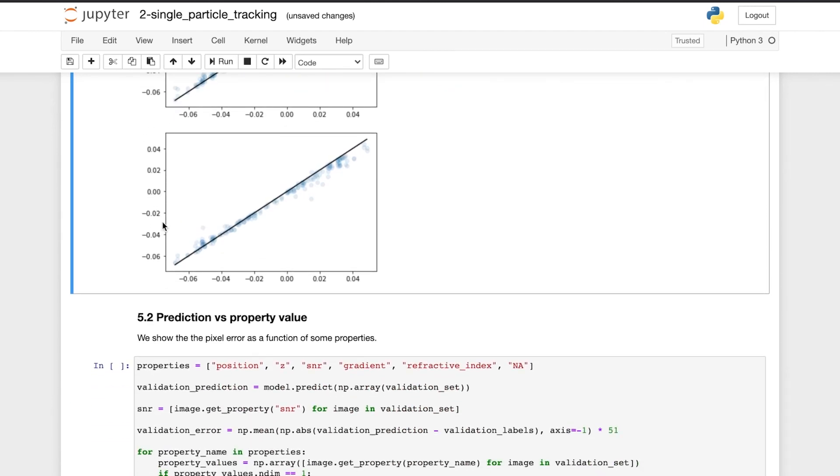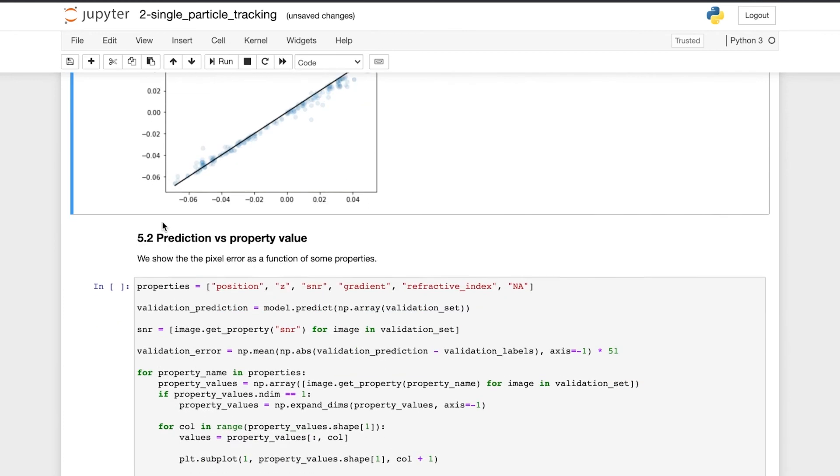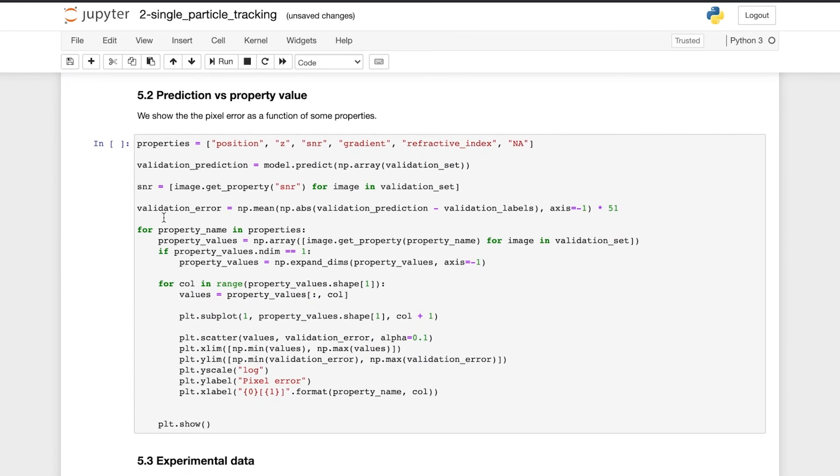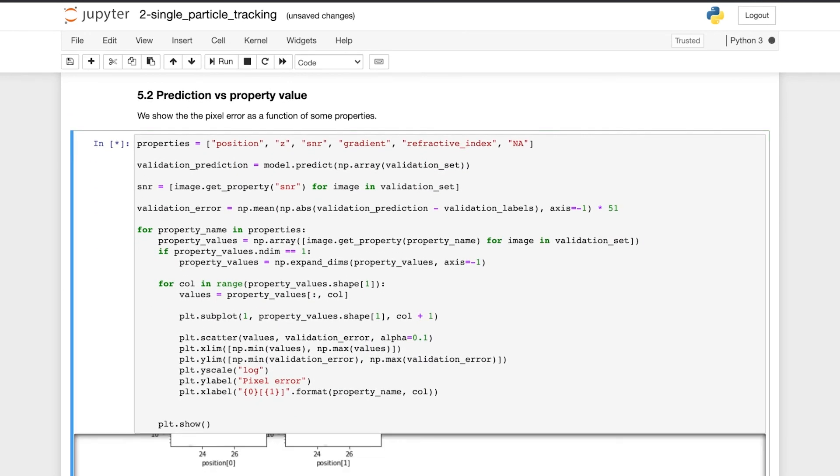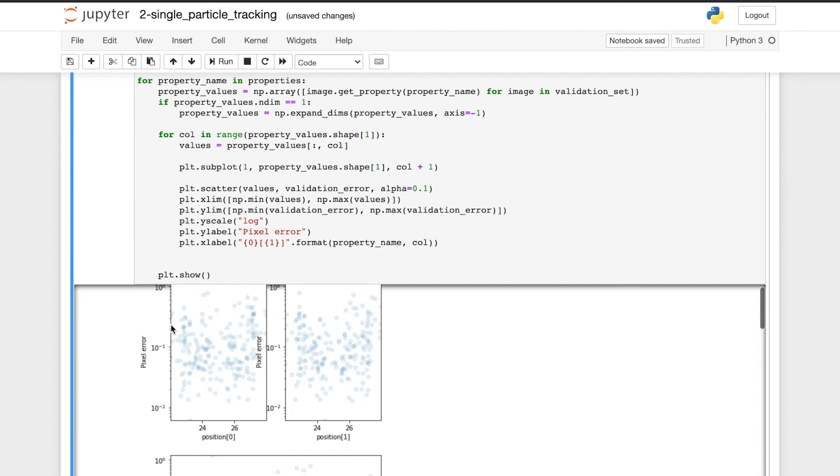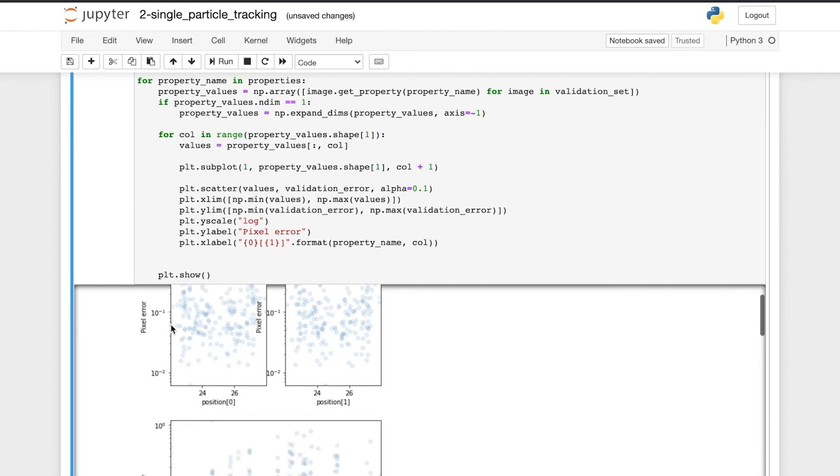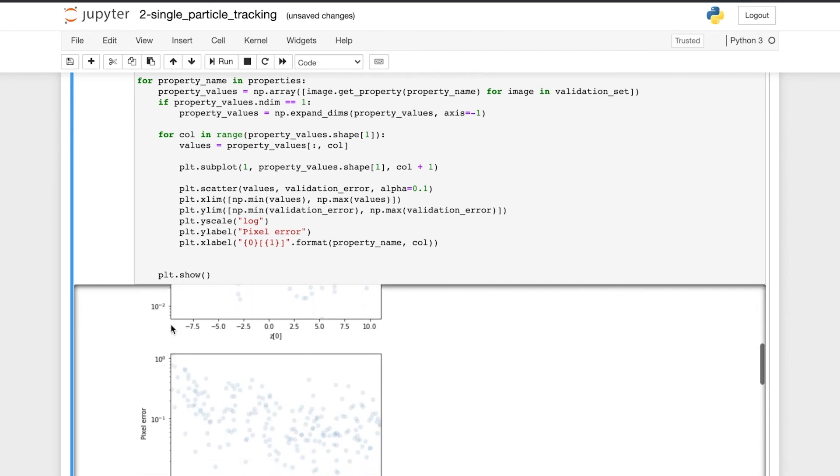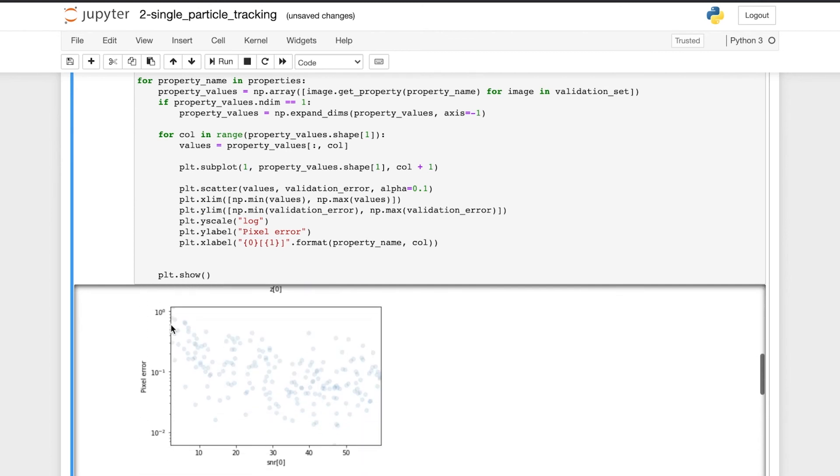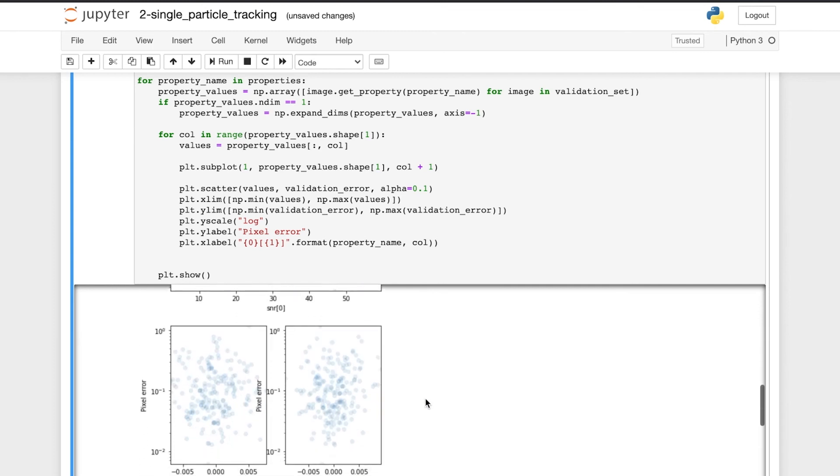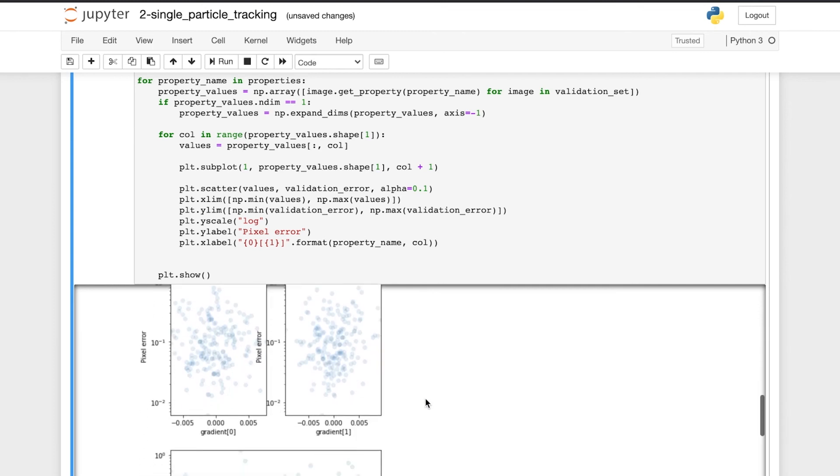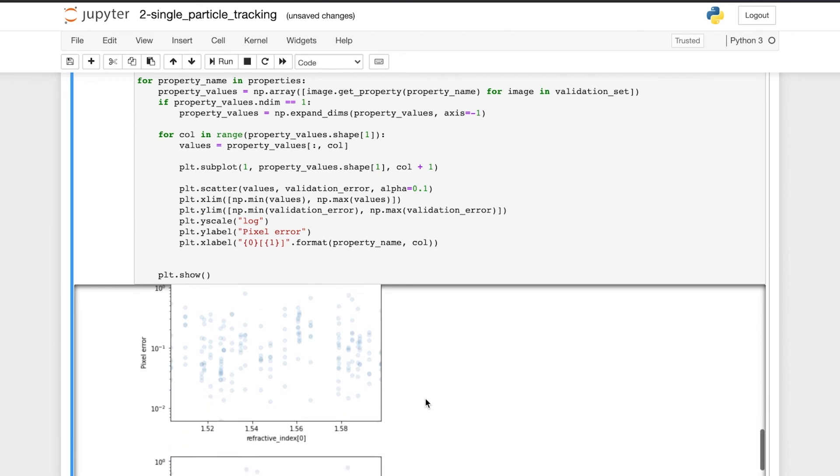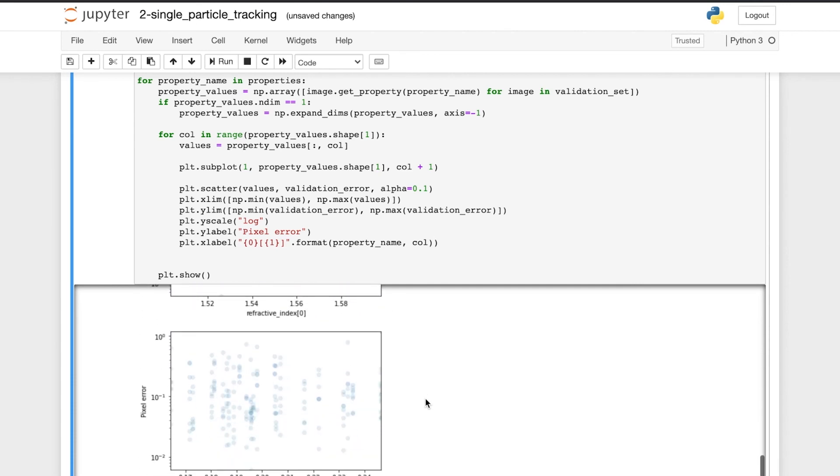We can also see the pixel error as a function of some properties of the simulated images, like the x and y position, the z position, the signal to noise ratio, the illumination gradient in different directions, the refractive index of the particles, and the numerical aperture of the optical device.